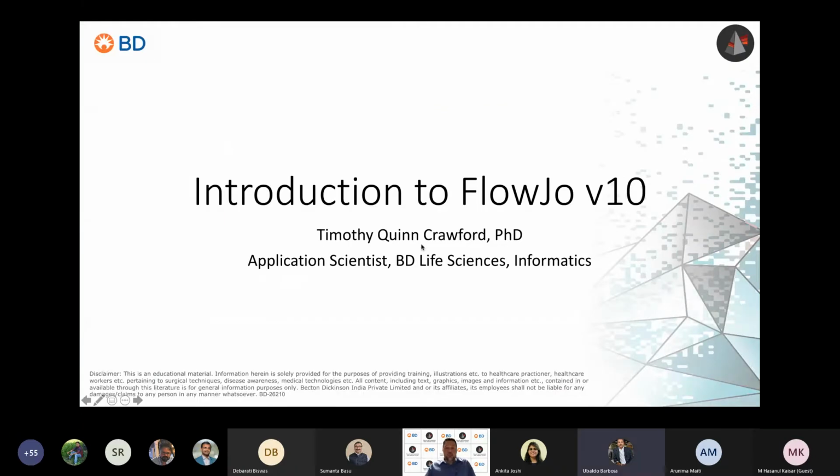So yeah, my name's Timothy Crawford. Okay, we can see it. Great. Yes. And this will be an introduction to FlowJo.